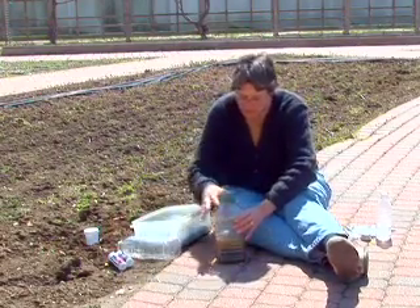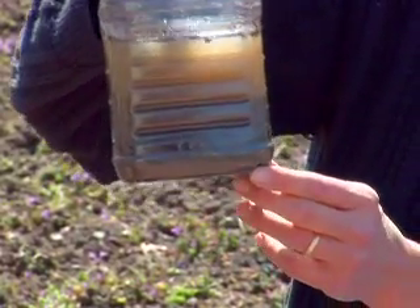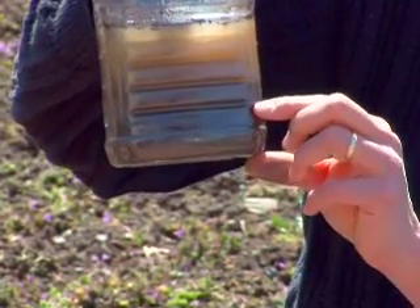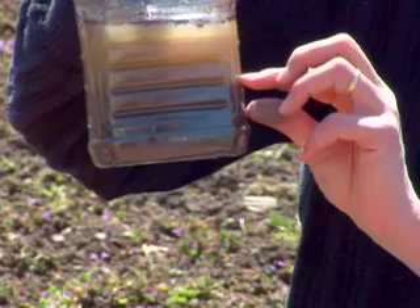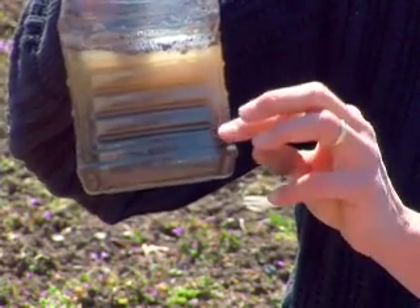So you can see what your soil texture is. This is a soil sample that I ran with my soil at home. I don't have very much sand, but I have quite a lot of silt that has settled out to about this layer, and then I also have quite a bit of clay, which is very typical of my soil at home — it's very clay.